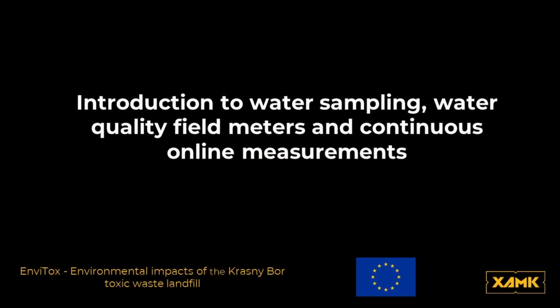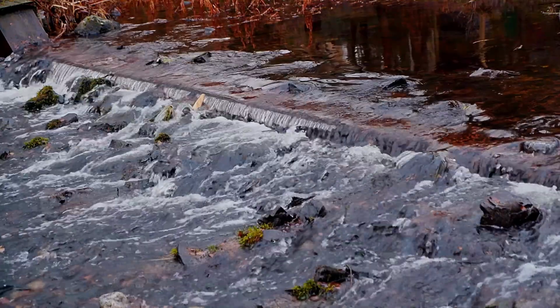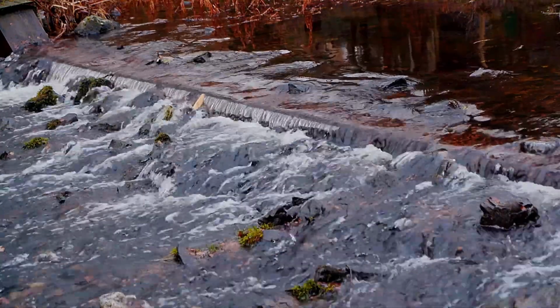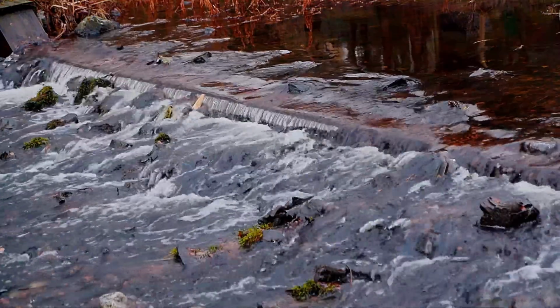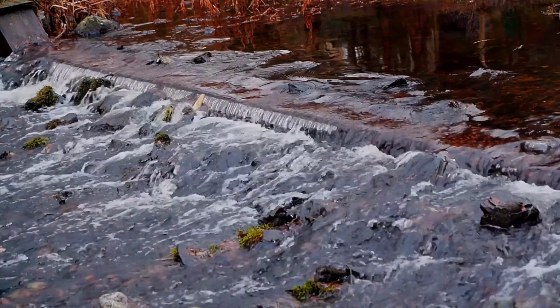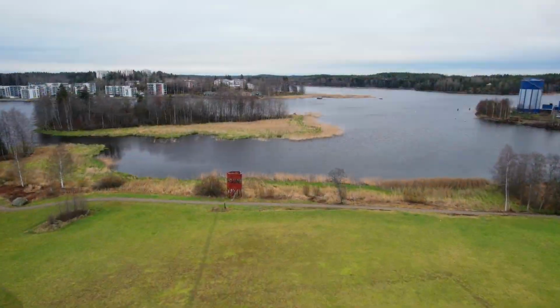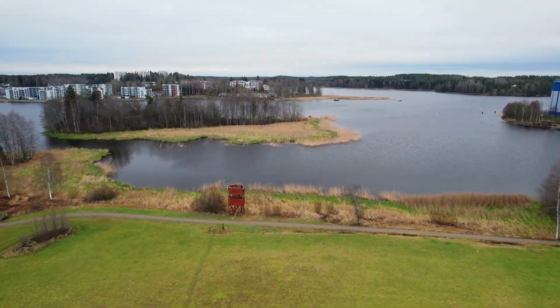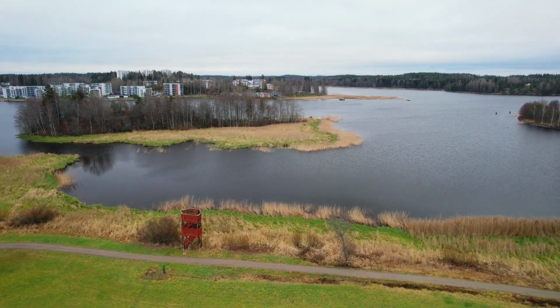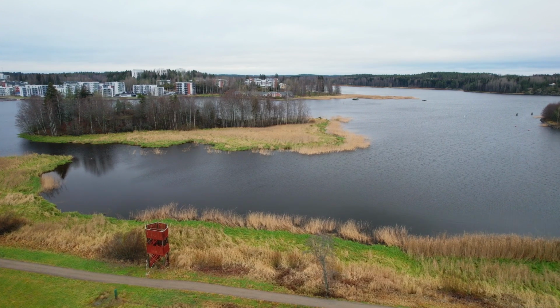This video is about water sampling in general and the operation of water quality field meters and continuous water quality meters. The aim of studying water is that the conducted measures represent the target water bodies and the situation at the time of the study as well as possible. The studies can include chemical, physical, biological, and microbiological assays in a laboratory or using field kits, for example. However, the methods and instruments used always depend on the aims.